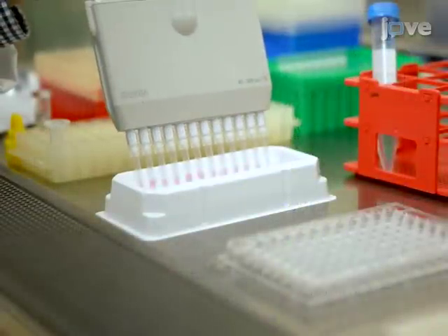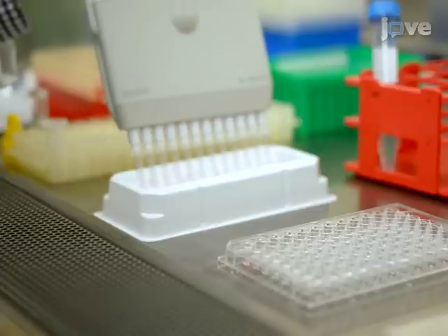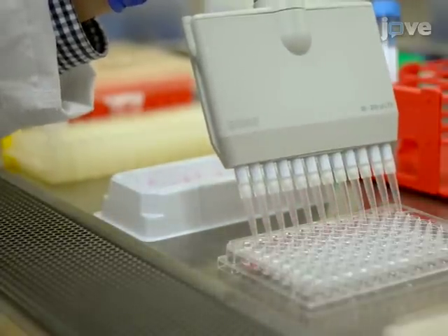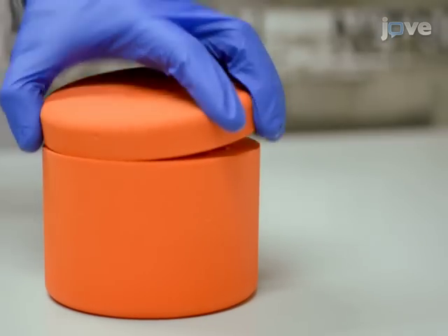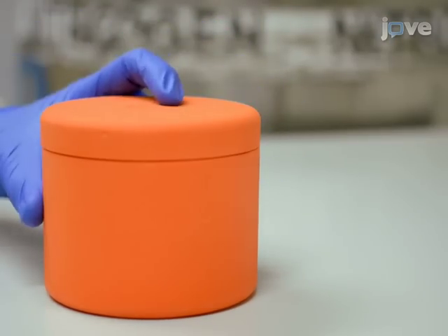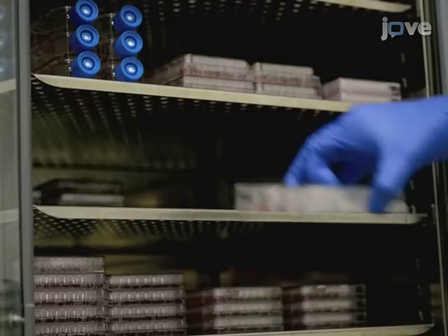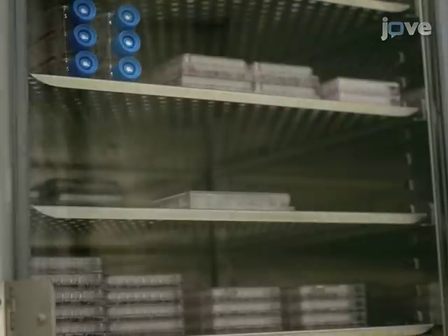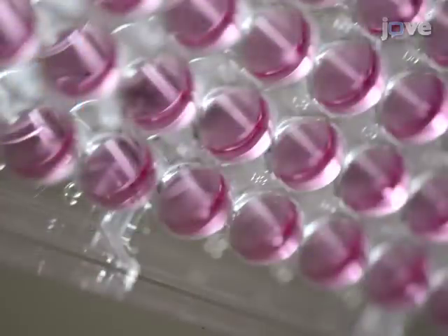After optimizing limiting dilution conditions for the cells of interest, plate sorted cells into a 96-well plate at a dilution of 30 cells per plate with 100 microliters of cell culture media per well. For the remaining sorted bulk cells, freeze half for future plating and plate the other half for screening and primer validation. Incubate bulk cells at 37 degrees Celsius for three to seven days, and allow the clones to incubate at 37 degrees Celsius for seven to 14 days, depending on the doubling time of the cell line used.